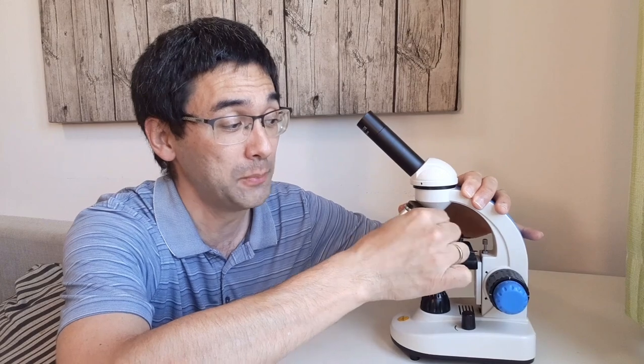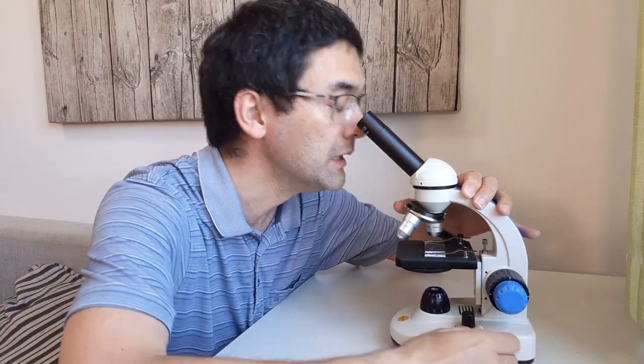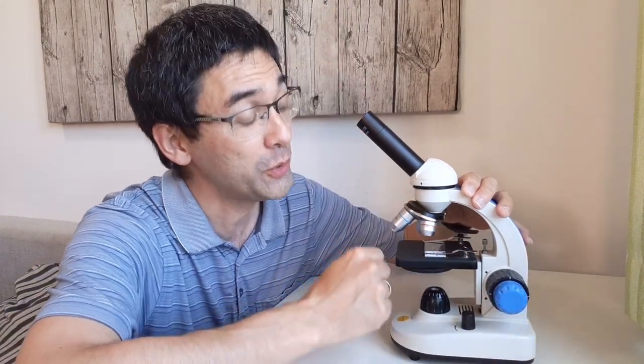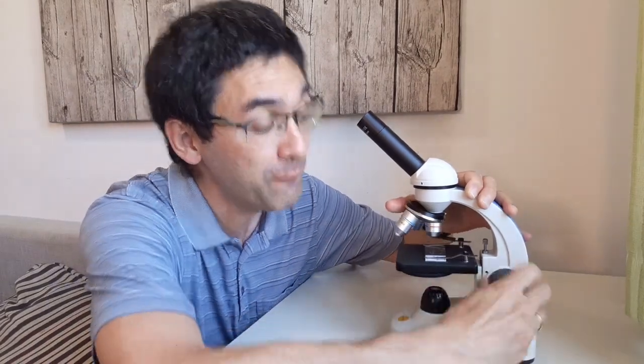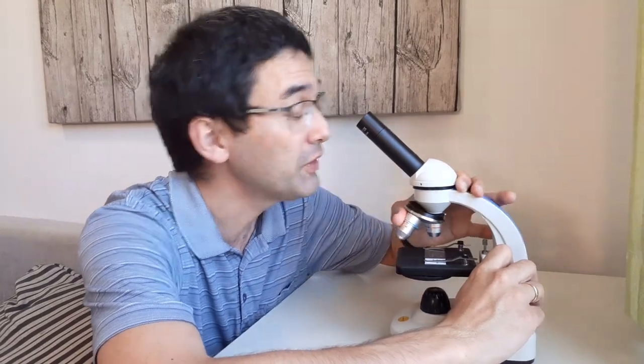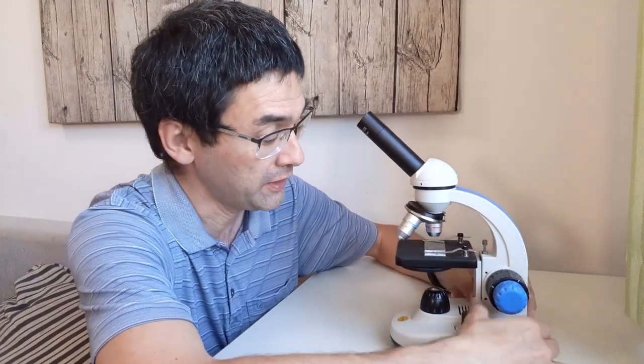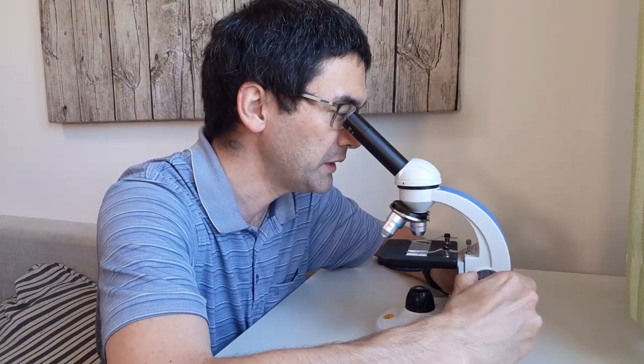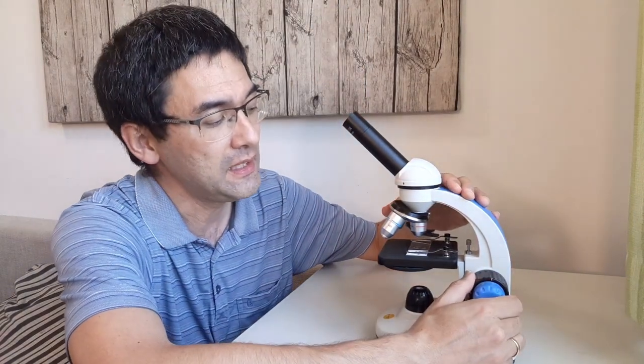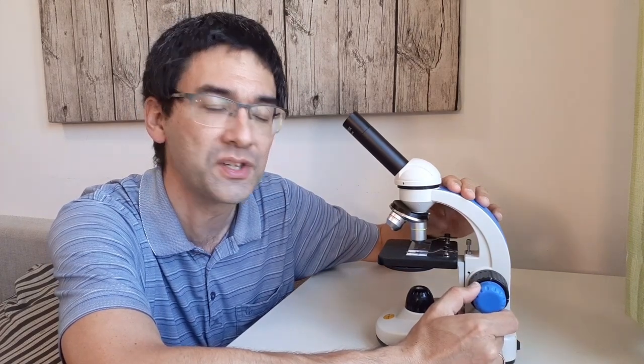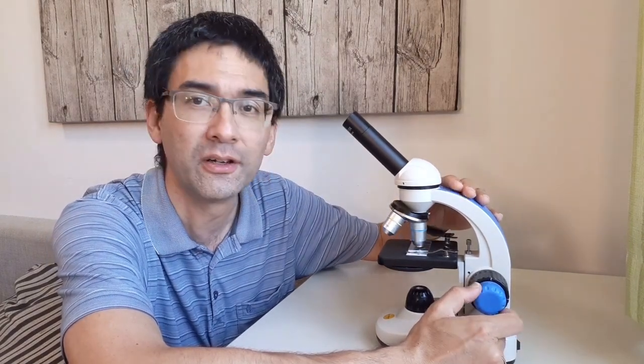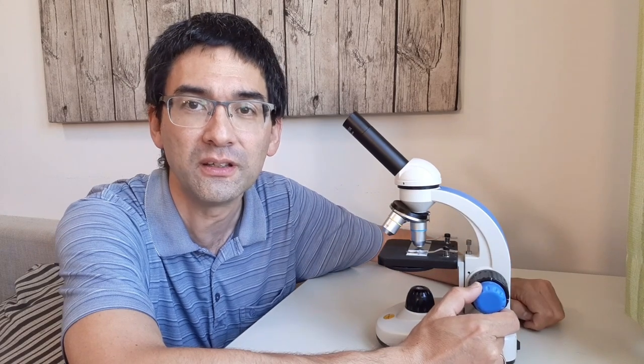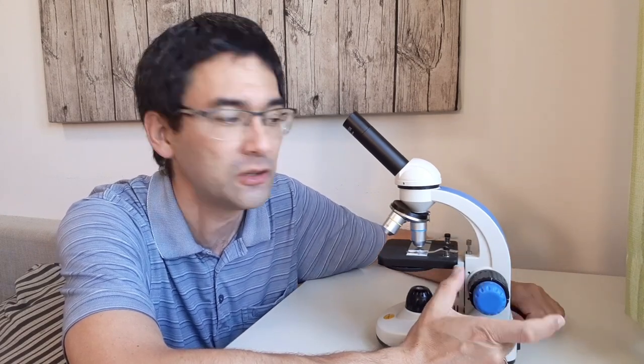So if you lose the focus again, it's totally blurry, I don't see anything. Well, then you do the following. You go back to the smallest four times objective. You raise the stage again. You look through it and you lower it until it's in focus. And that's it. Don't use the coarse focus knob when you have a high power objective in position because otherwise you risk crashing the objective into the slide.